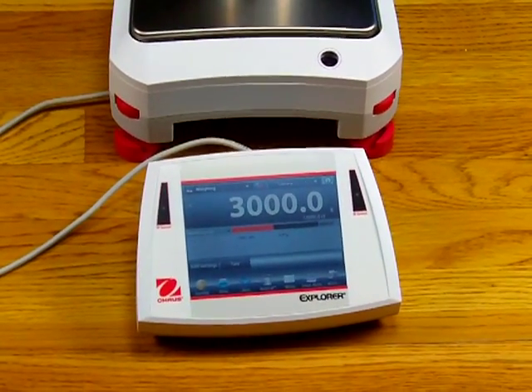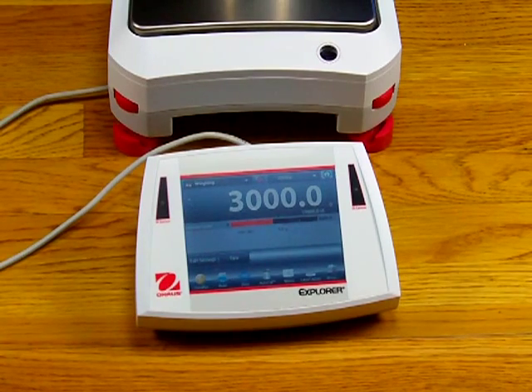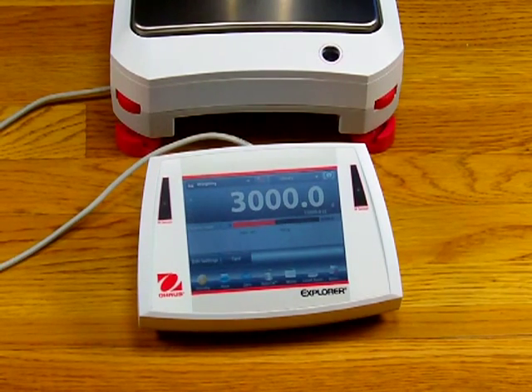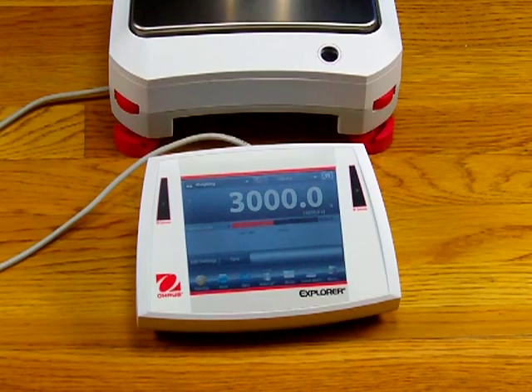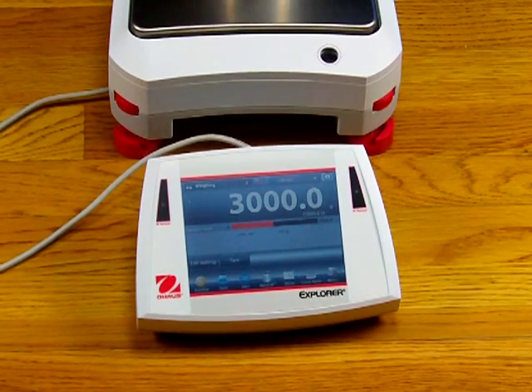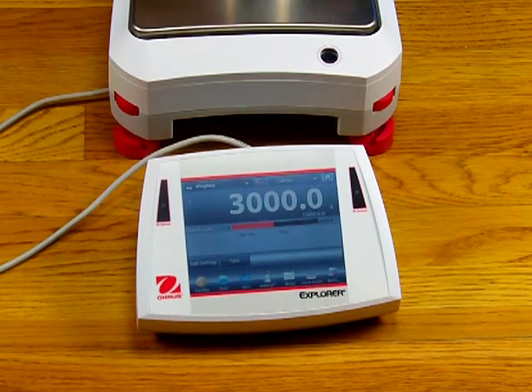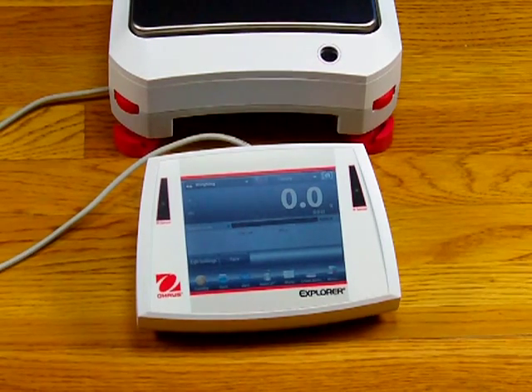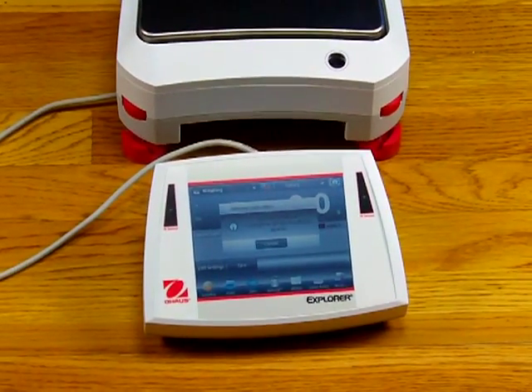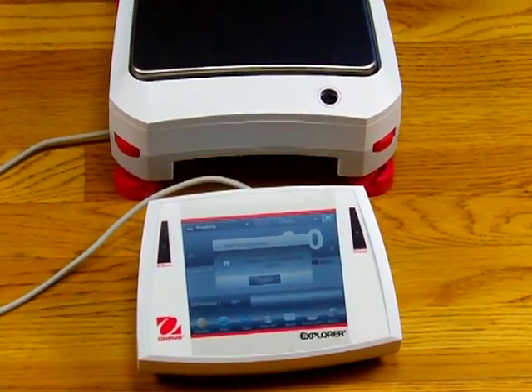Other features on the Ohaus Explorer include the statistics function. The statistical quality control features are useful during various types of fill-in operations, especially for monitoring over and under applications. The user can specify these settings and store them in the Ohaus Library for easy recall. All of the new Explorer Voyager series has motorized internal calibration, so calibration is simple and fast. I'm just going to wave my hand over the sensor and, as you can hear the motor, the balance performs the calibration.